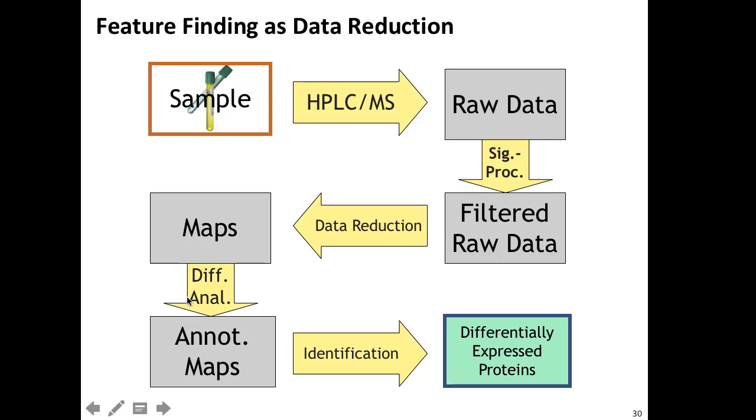Once we do this differential analysis, we can also ask things like, what are the features that are really differential between, say, two groups, or that are not in the blanks and still differential between the two groups, or that are mutually differential between any pair of groups if you have a more complex design. Once you have that, you usually end up with just a list of differential proteins. And that can be reasonably short. That's usually literally just a spreadsheet with a couple dozen or a couple hundred proteins.